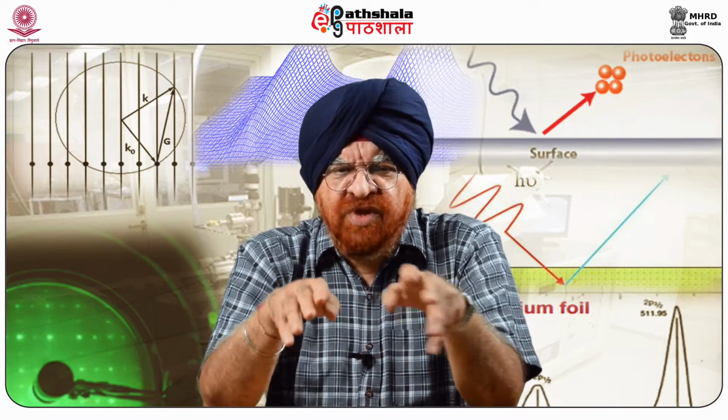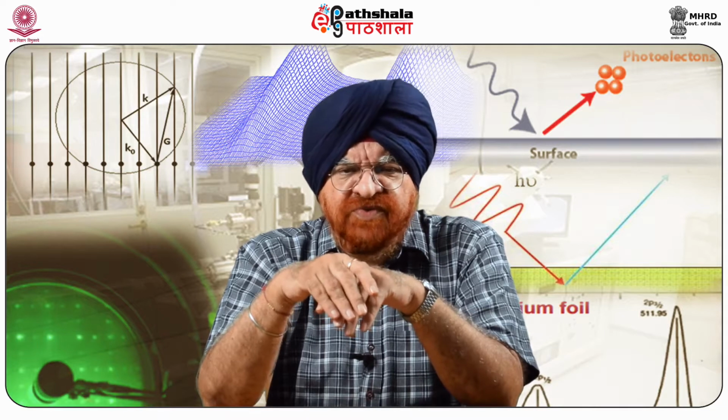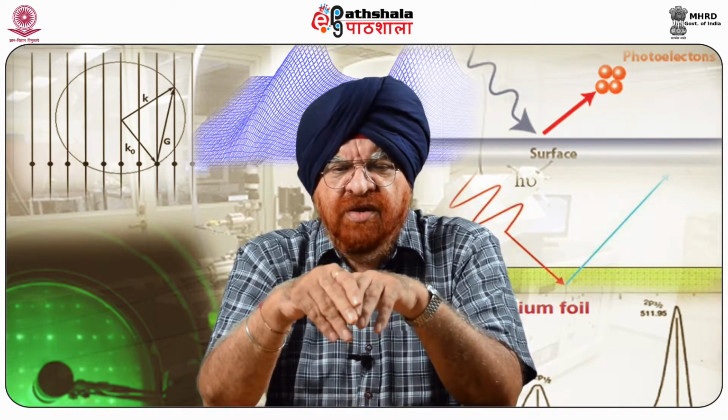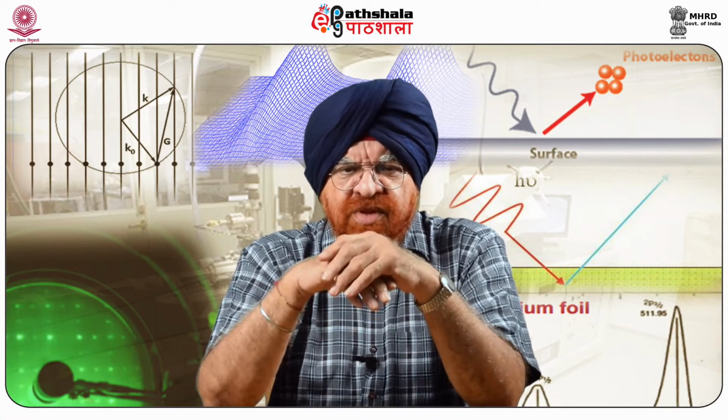Chemical force microscopy, a technique that uses direct chemical functionalization of atomic force microscopy probes with specific functionalities, allows researchers to investigate these important interactions directly.